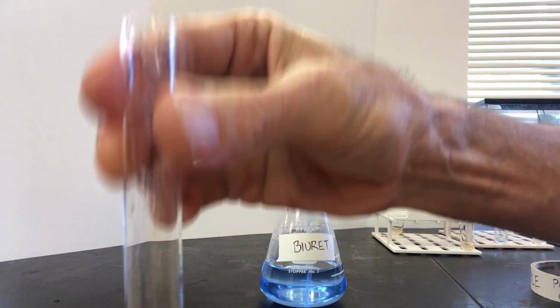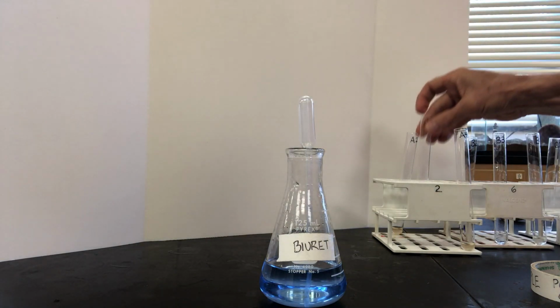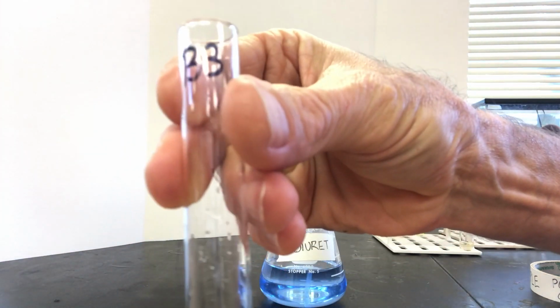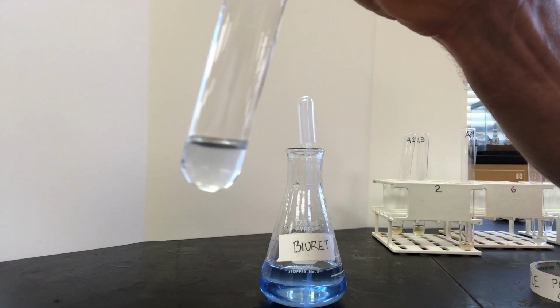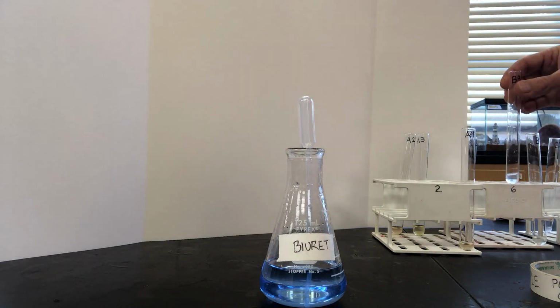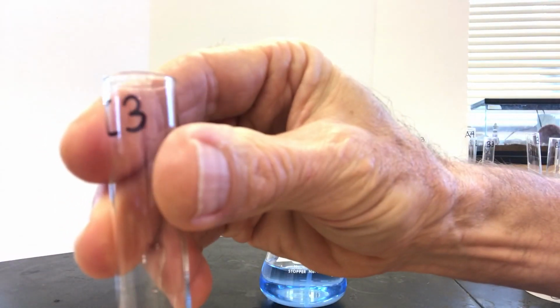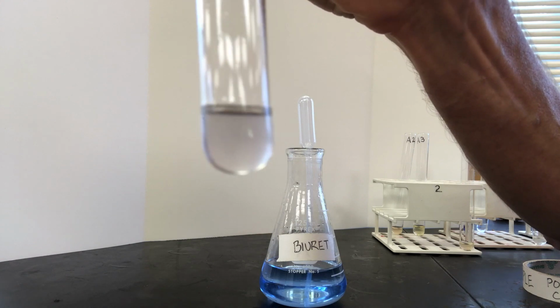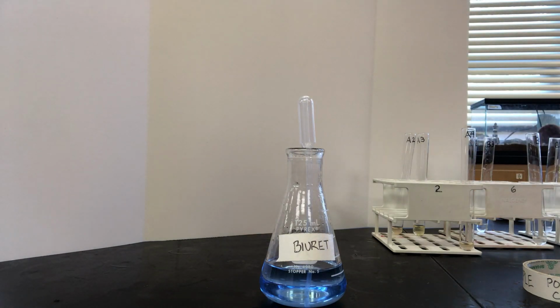The Biuret test gave the following results. A3, B3, C3, and D3.